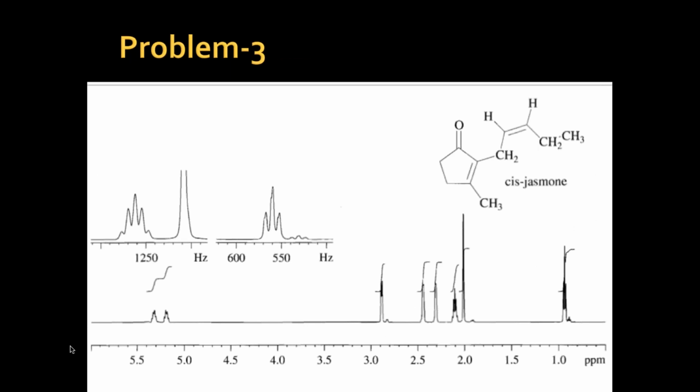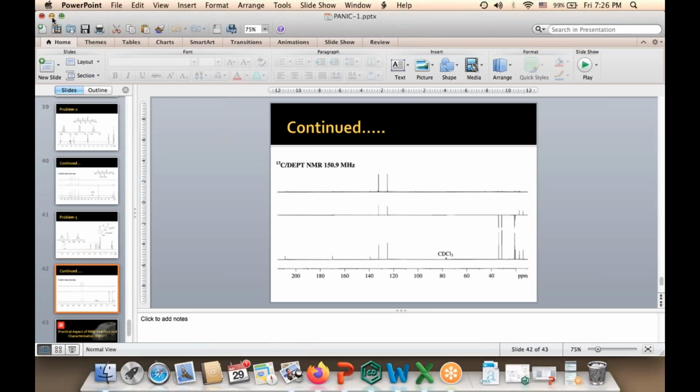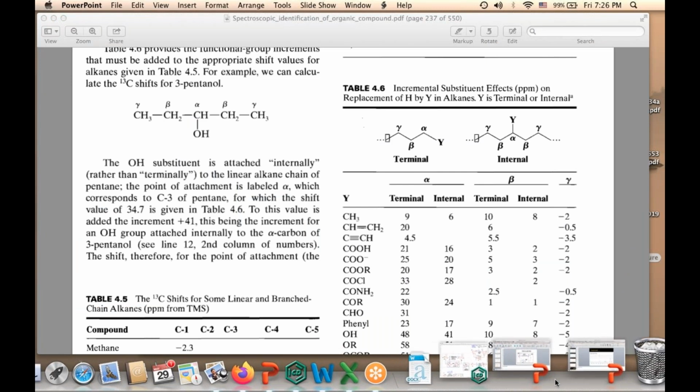Of course, it will help up to a certain point, but still the problem will remain the same. You will not be able to identify which hydrogen is which. So if you want to make sure of that, we have to study DEPT, HSQC, NOESY, and NOE. In the next session, I will cover C13, NOE, and NOESY, so you will have a clearer picture about those things.